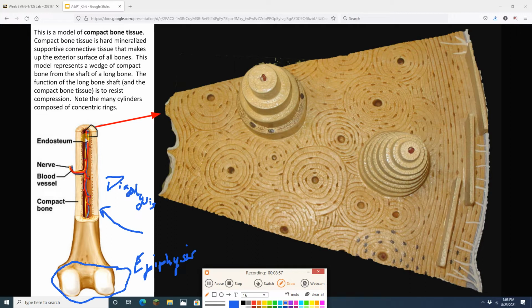Now notice that in the diaphysis, in the shaft, there is this cavity that is called a marrow cavity. You can guess what's in there, right? Man, that's not good handwriting. Trust me, that says marrow cavity. In the marrow cavity, we are going to find bone marrow. We'll talk more about bone marrow later. What I'm really interested in today is the bone in the diaphysis, this bone surrounding the marrow cavity in the shaft. That's what I'm super interested in today.